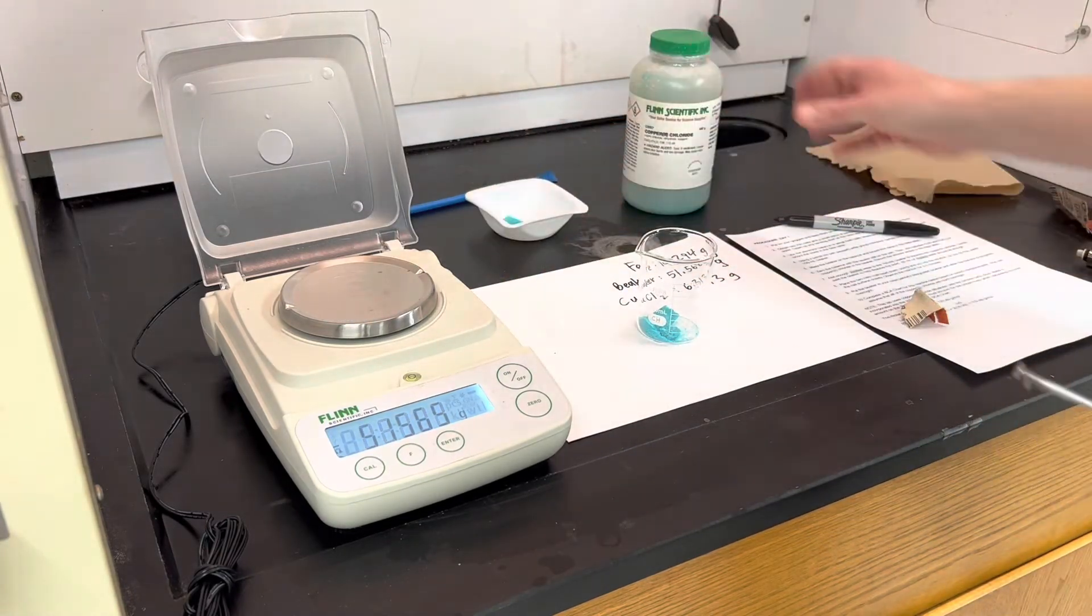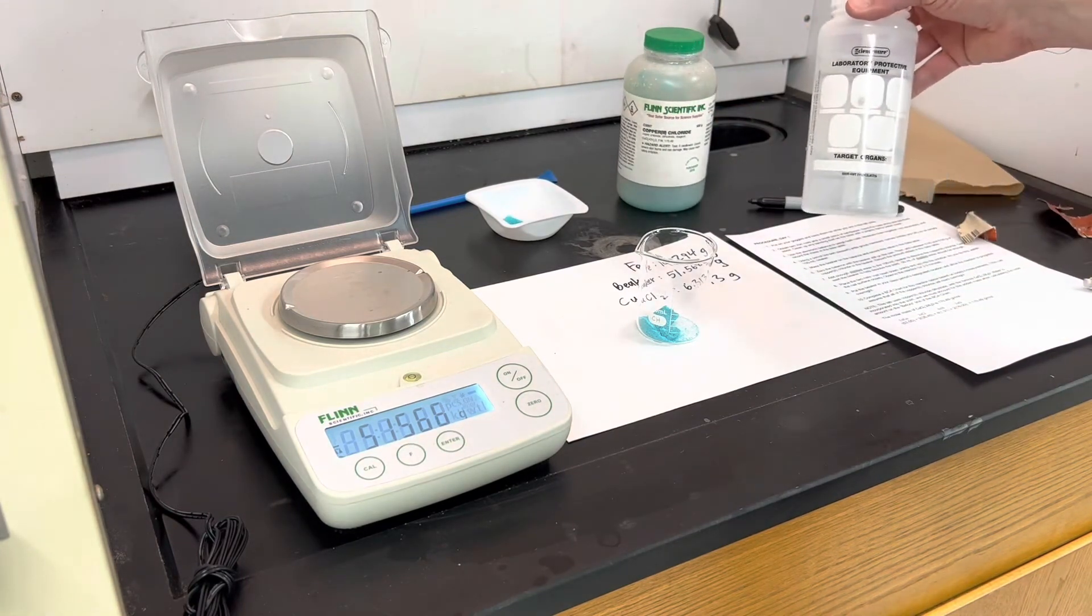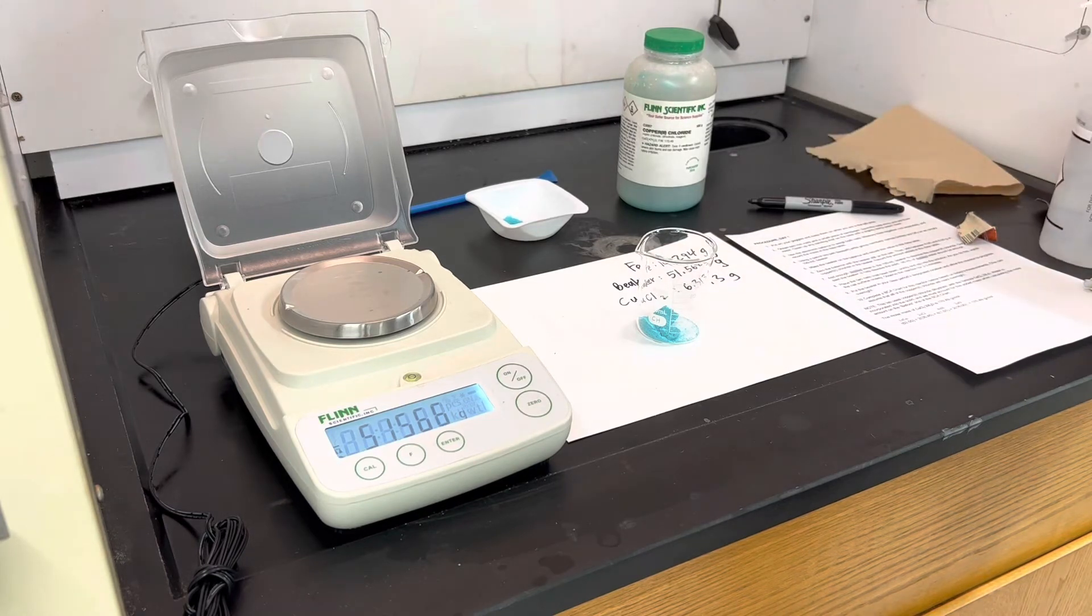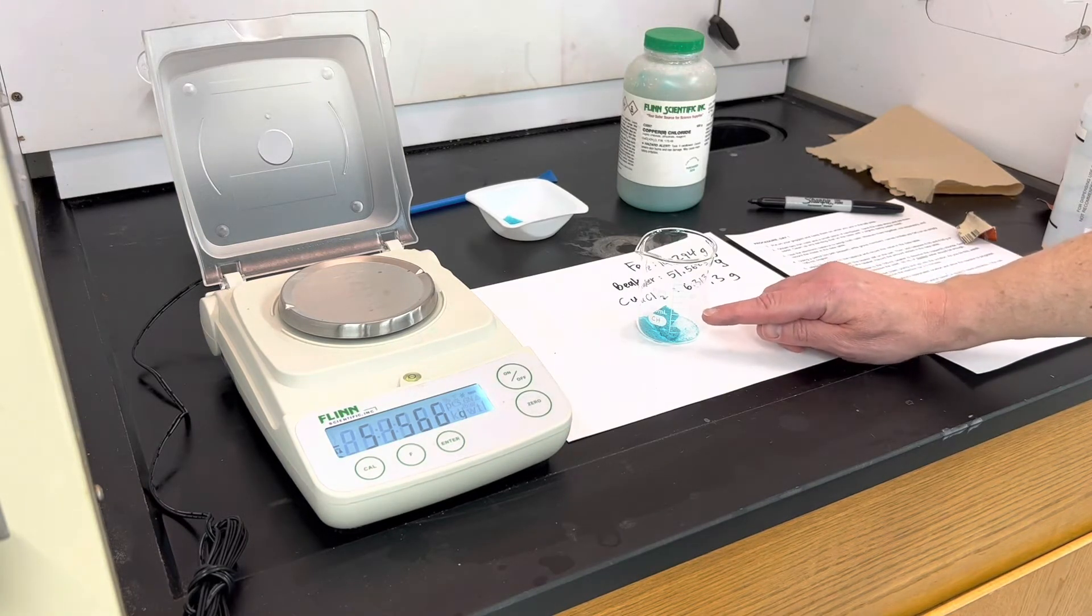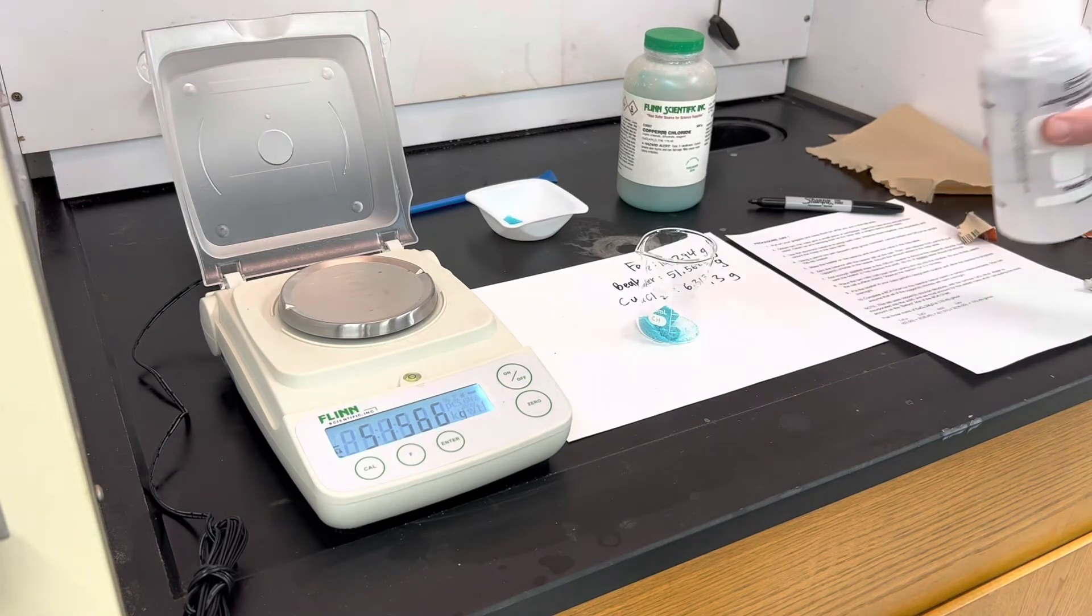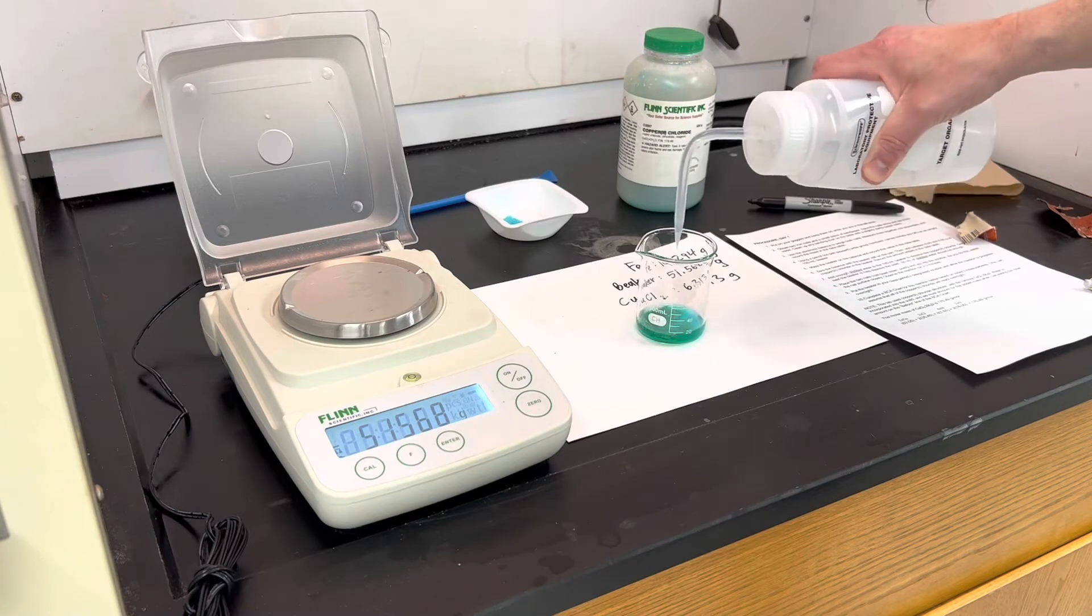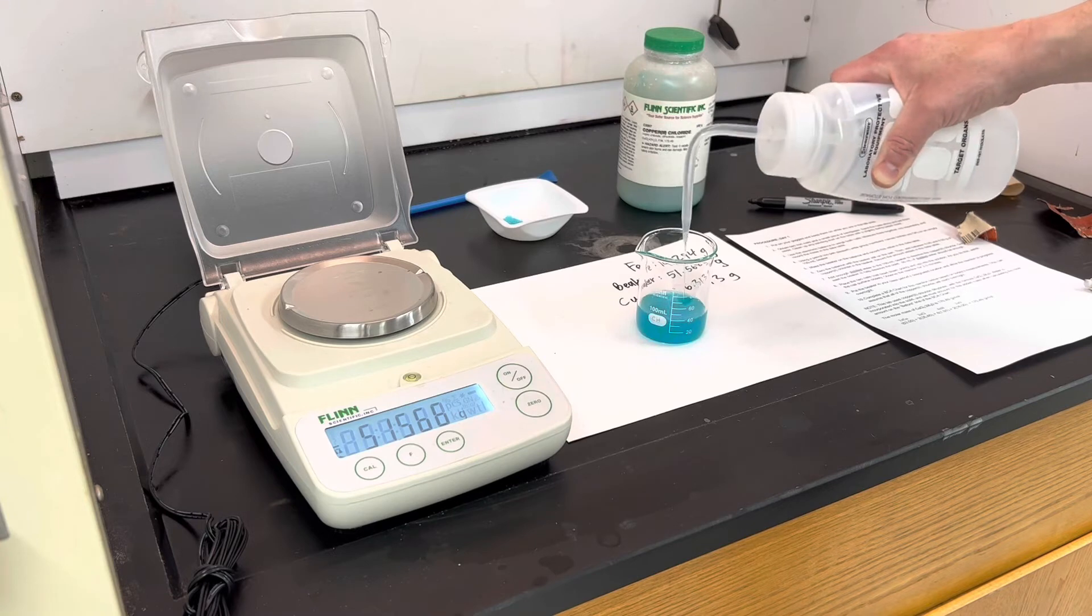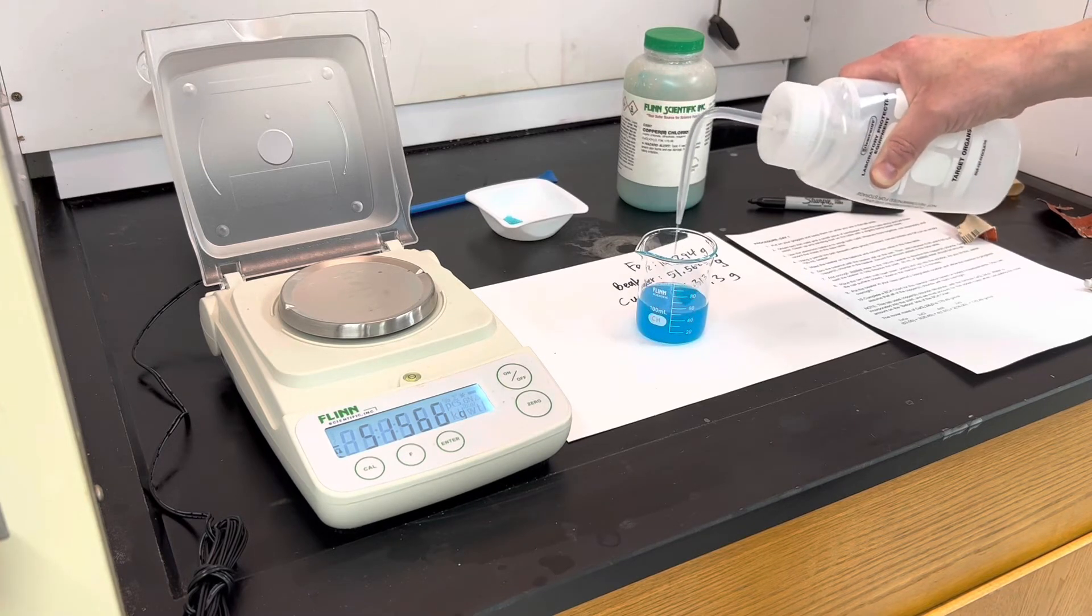So next I want to prepare a solution of copper chloride. It says add enough distilled water, so you'll have distilled water in a rinse bottle to dissolve the copper chloride. It suggests about 60 milliliters. And on this particular beaker it is marked. I don't need to be exact, but around 60 milliliters will be a good amount. So I'm trying to dissolve the copper chloride, and you get a nice bright blue solution.